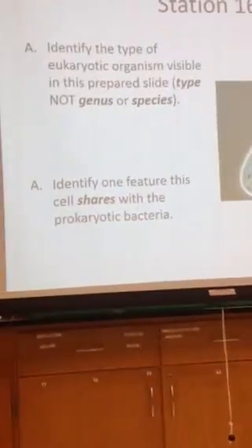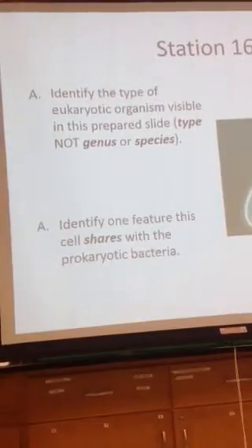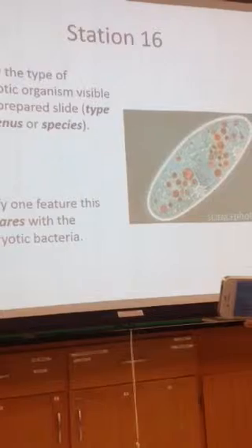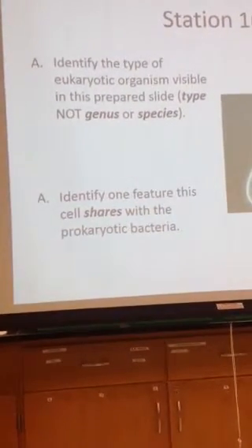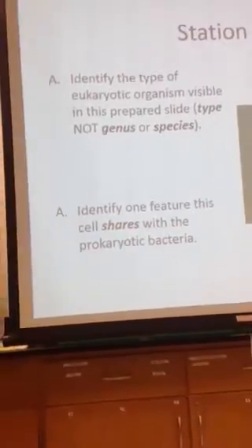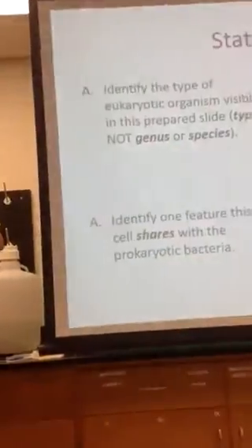Now, I don't want genus or species. All I want you to do is tell me generally what we're dealing with. Somebody told me protist. I probably would have taken protist. But this is paramecium.